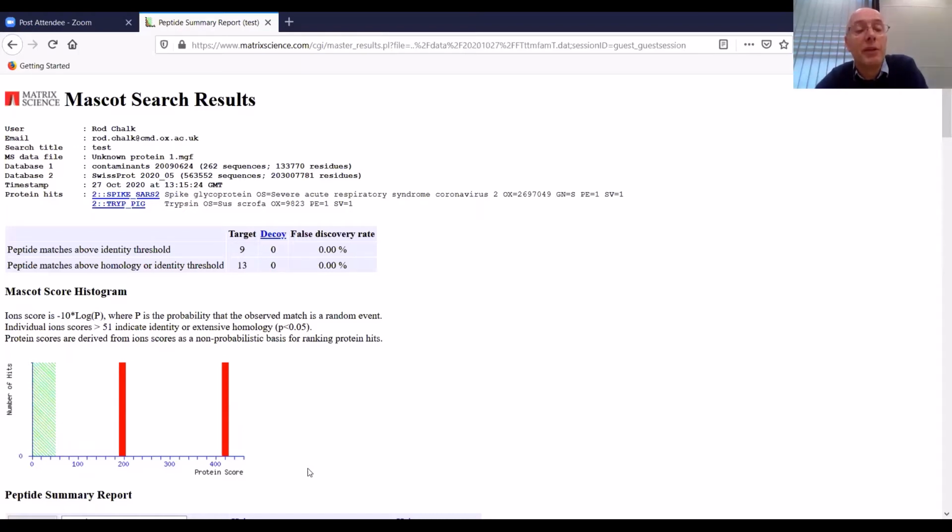So the tolerance is a measure of the type of instrument it is. You can have different types of instruments. So high mass accuracy instrument would be something like an Orbitrap. I would expect a mass tolerance of about 1 part per million. For a time of flight instrument, 5 to 10 parts per million. For an ion trap instrument, it's much lower than that. It's about 300 parts per million. And we specify that in Daltons rather than in ppm. However, that's not really the important thing. The important thing is the fragmentation match, as I'll show you in a minute. Does that answer your question? Yes, thank you so much.